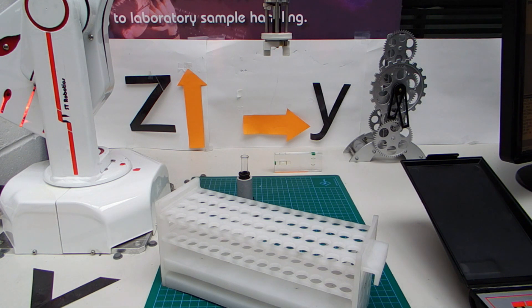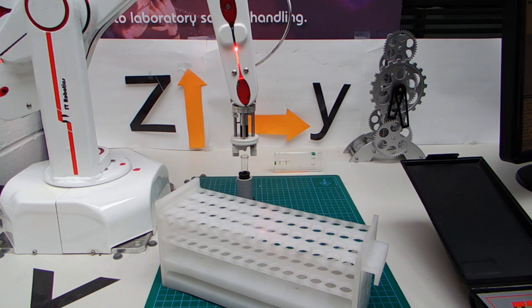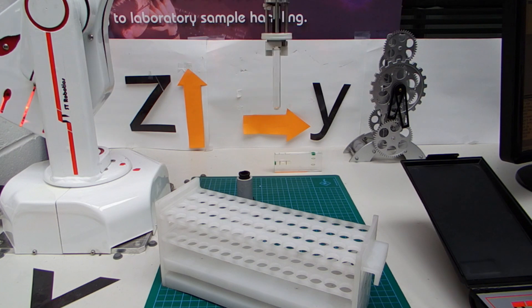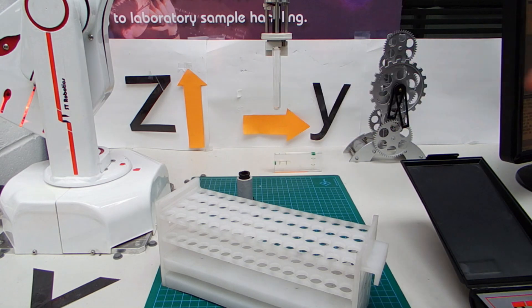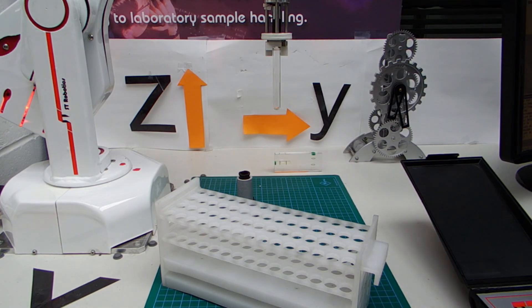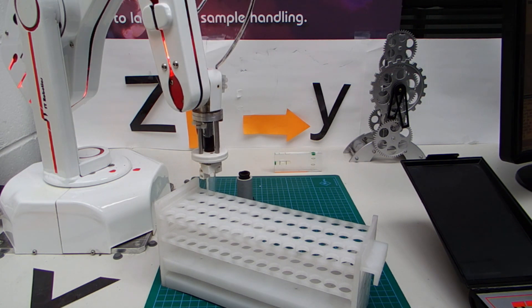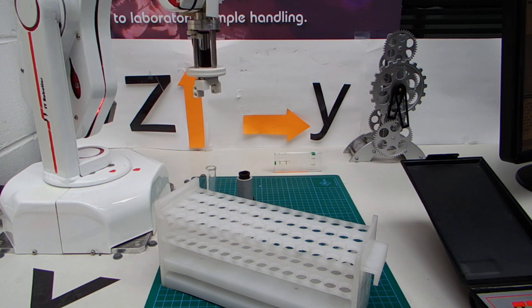So I now pick up the tube — the command is called holder. So: holder, grip, withdraw. Up to safe. And then I can put it in any position. Let's say I want to put it in position fourteen, which is just here. I write fourteen, then into, then un-grip. And move up — the command is up — to move away to the approach position.